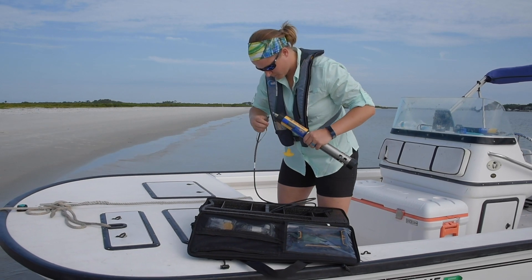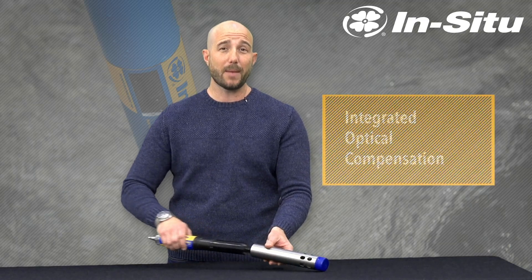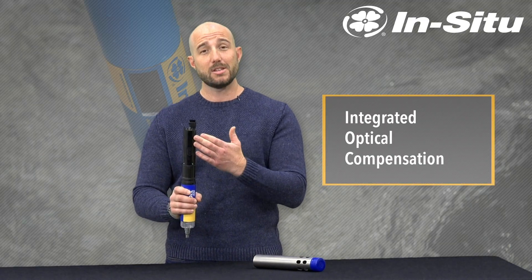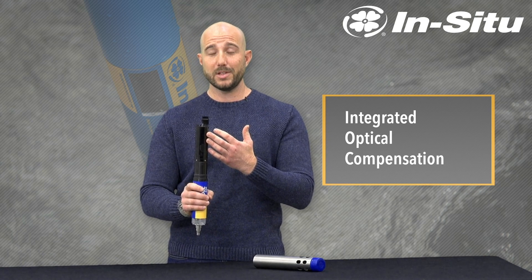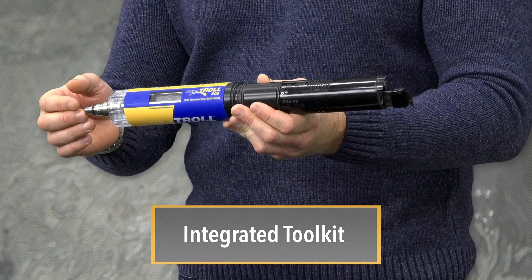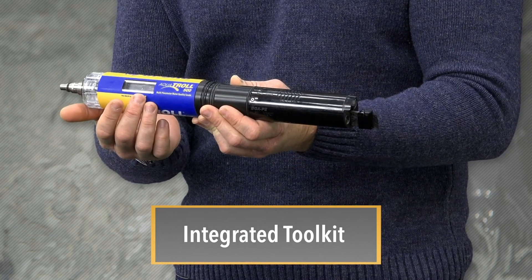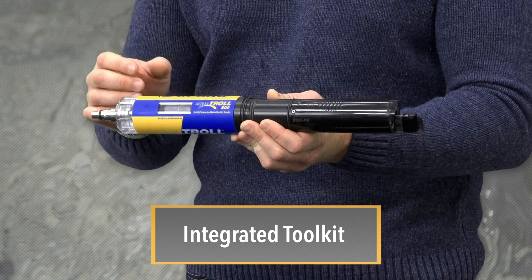The good news is INSITU designed the Aquatrol 500 to deal with many of these common problems. The instrument features integrated optical compensation on the fluorometers to maintain long calibration periods in the field and keep you from having to go out to your site. The unit also has an integrated toolkit featuring SDI-12 communication and a built-in LCD screen so you can connect to any PLC you happen to be using and check the status of your sonde.